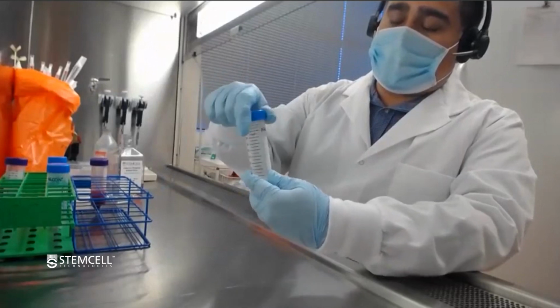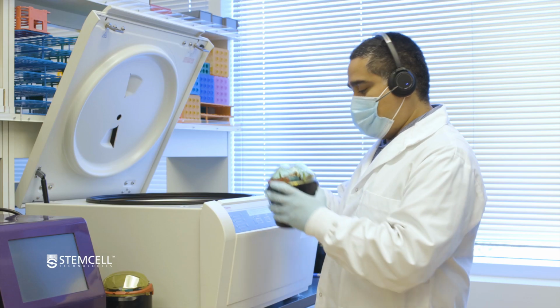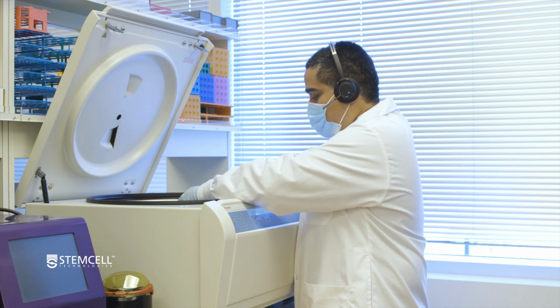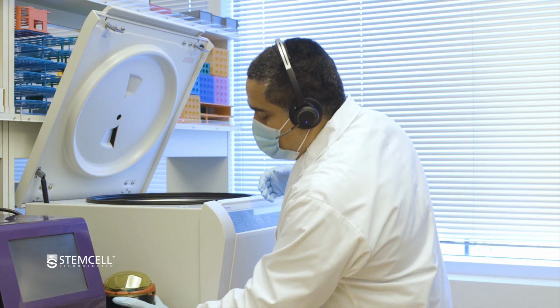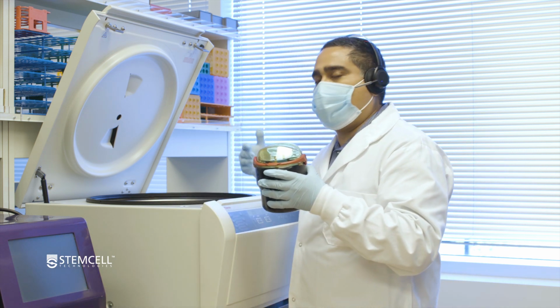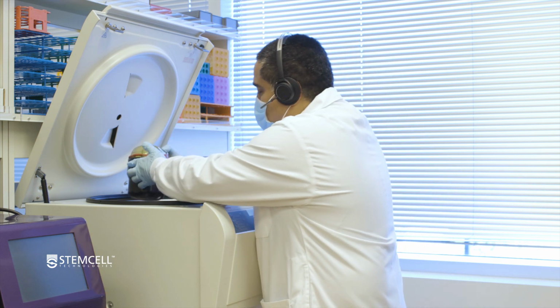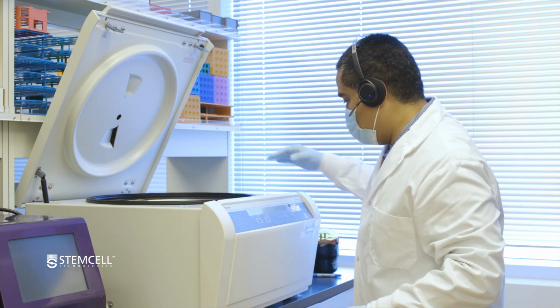And we're just going to spin this for 300 times G, 10 minutes, brake on. So here I just have a balance, and I'm going to be spinning the wash. Typically, we suggest doing 300 times G for 8 to 10 minutes. In this case, we can just do it for 8 minutes. If we want to do it for a little bit longer, say 10 minutes, that's perfectly fine.